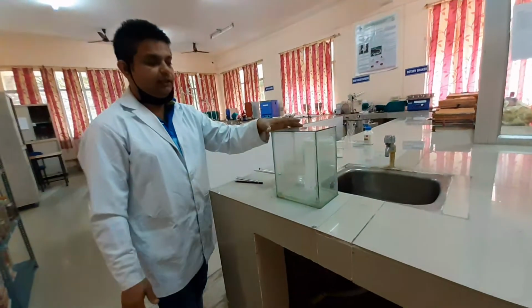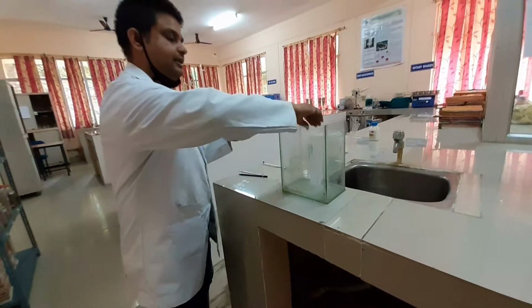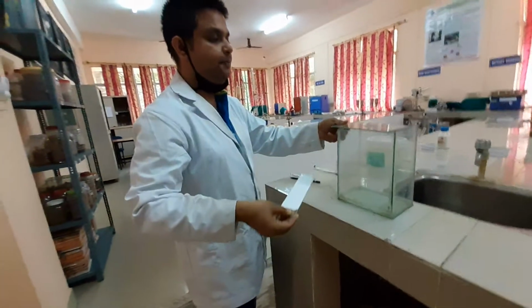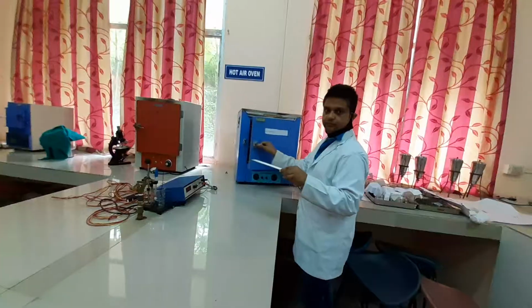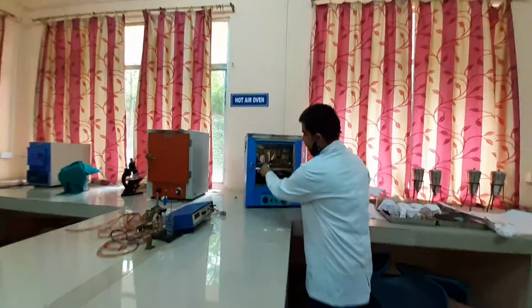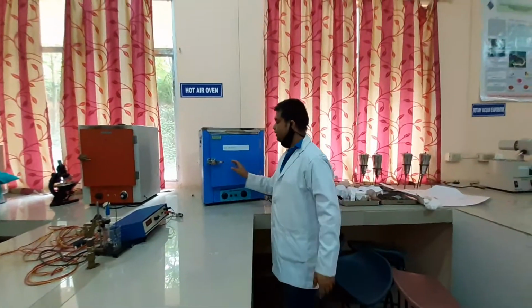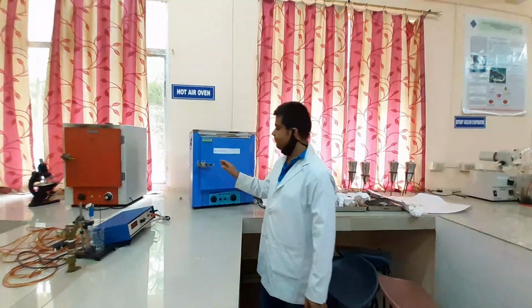After obtaining the necessary 10 centimeter, you take out the plate and you keep it inside the hot air oven. So this is the hot air oven. You keep the plate inside the hot air oven and wait for some time till the plate gets dried.